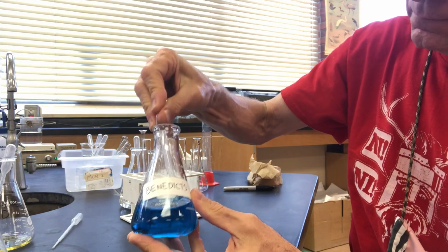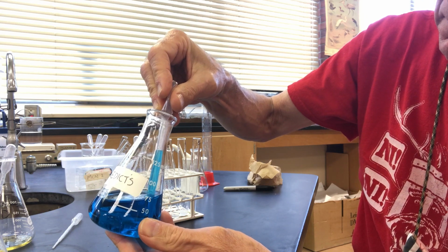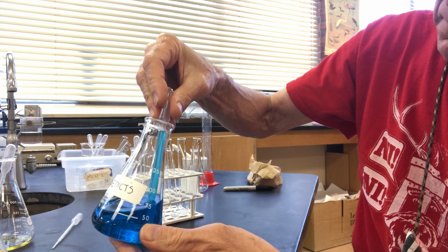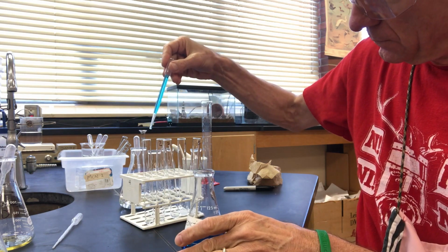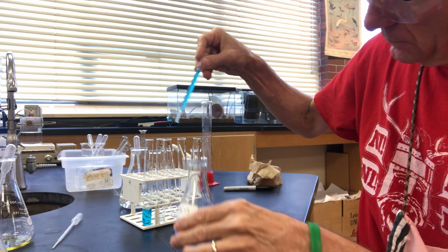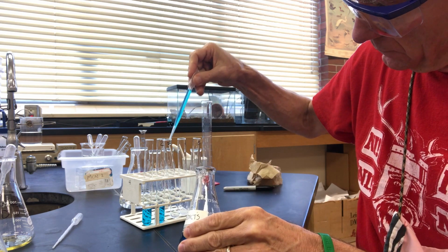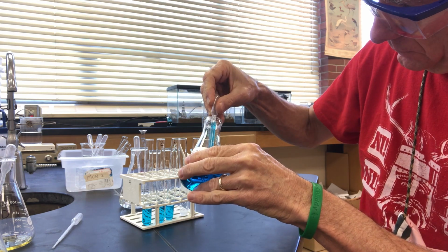The Benedict's test determines the presence of simple sugars, or monosaccharides. The bright blue solution in the presence of monosaccharides in high heat causes a change that results in the colors ranging from bright red-orange, if there's a lot of sugar, to brown and even green if there's only a small amount of sugar. There's also a precipitate that forms and can make the clear solution become cloudy.